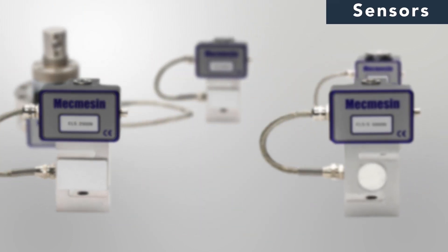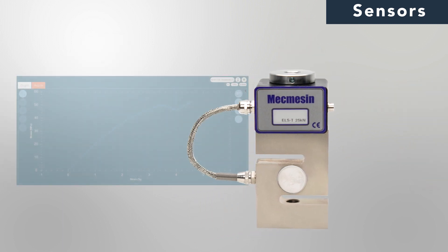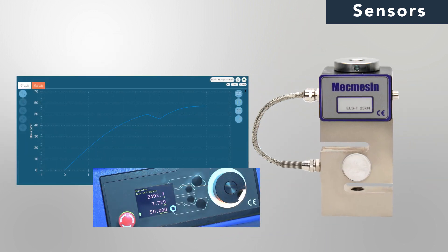To get the most from your OmniTest, the ELS range of load sensors delivers excellent accuracy and outstanding resolution. This allows you to precisely detect even the smallest of load changes.